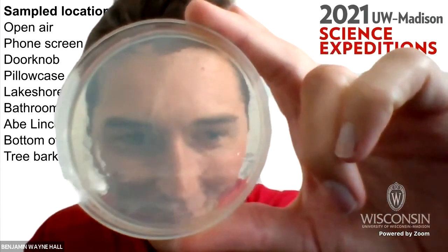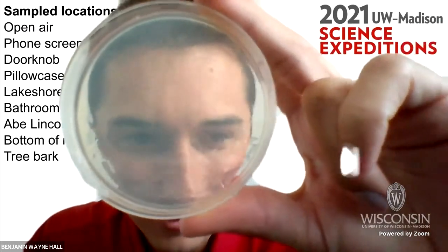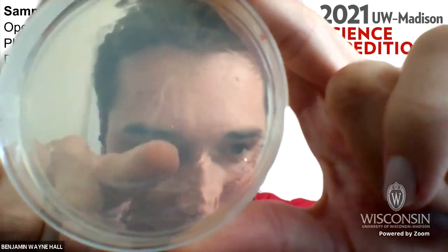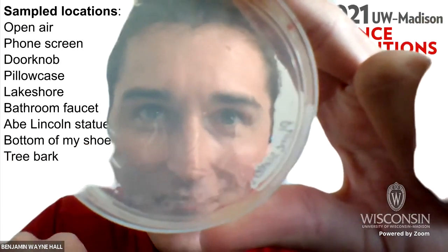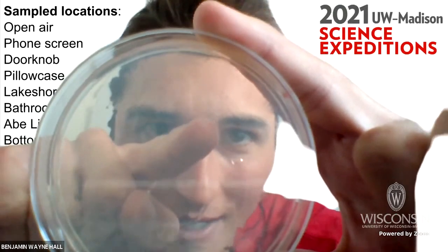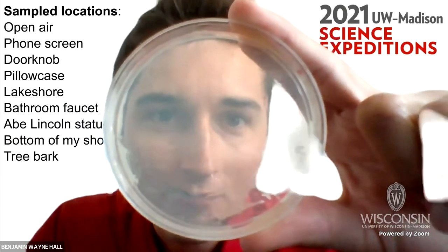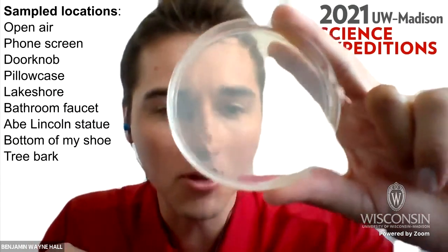So in front of my face, we can actually see there's hardly anything on this plate. There's one colony right here. You can see there's this white dot that I'm trying to put my finger behind. So we did see one colony of bacteria here, and there's a couple more that I can see, but I can't really see them through the camera because they're so faint and so small. But I do see a couple on here.